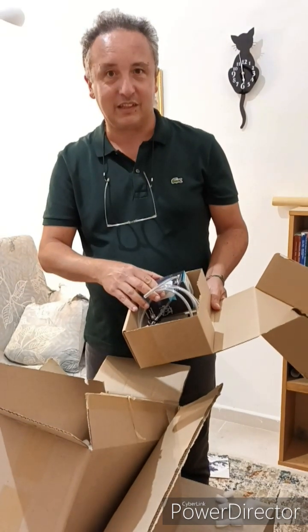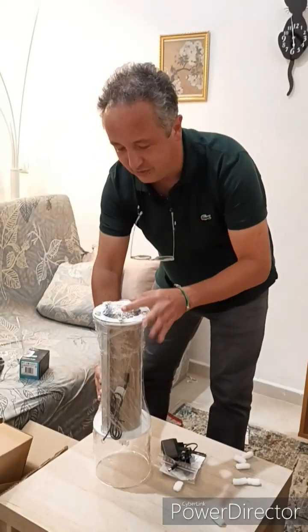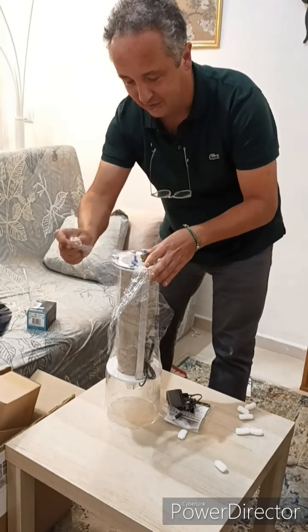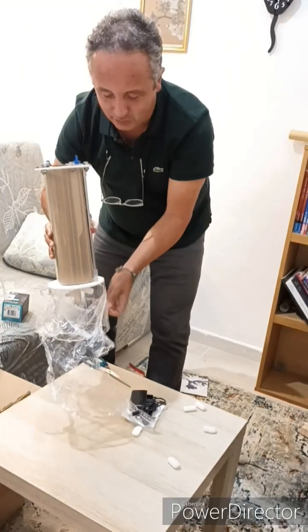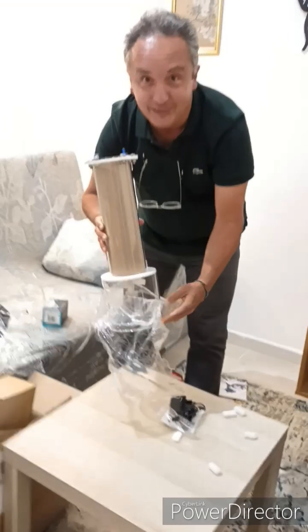...they eat carbon dioxide — CO2 concentration, this one. It seems very professional. I hope the project may be easier than unpackaging this bioreactor!